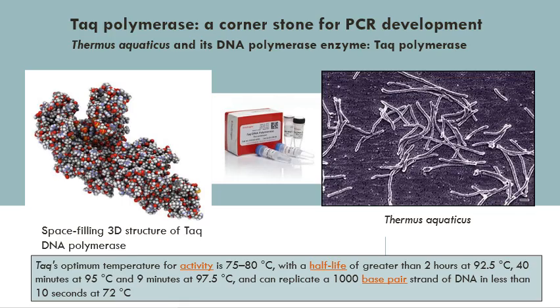What's a PCR? PCR, from its name, is the polymerase chain reaction. It's a sequence of reactions that happen in vitro to reassemble the DNA replication process that is happening inside the body. Well, why do we need this process? If we have a segment of DNA, we need to amplify, or let's say diagnose, this part of the DNA, or investigate this part of the DNA more.